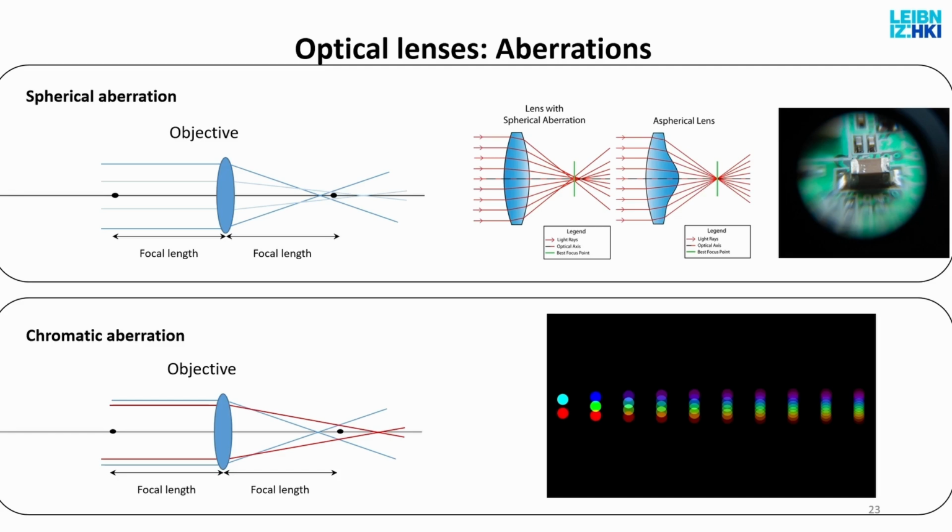How do you measure it? You take an artificial object like a piece of plastic, a piece of polymer. It is perfectly spherical. You can buy these things. These are called beads, fluorescent beads. And these plastic particles can be stained with different colors: blue, green, yellow, red, whatever.